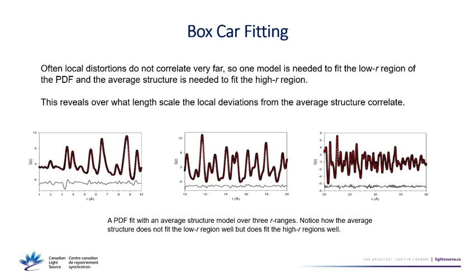So what you can tell is here at low R, there's some deviations from the average crystal structure which don't show up in the Rietveld refinement, and particularly has to do with whatever atoms make up this peak. So what you can do with this is you can then adjust your model till you're fitting this, and then you have some description of what the short range order is.